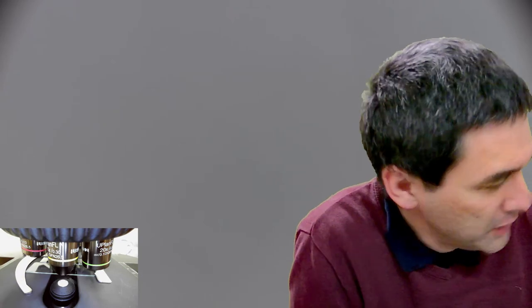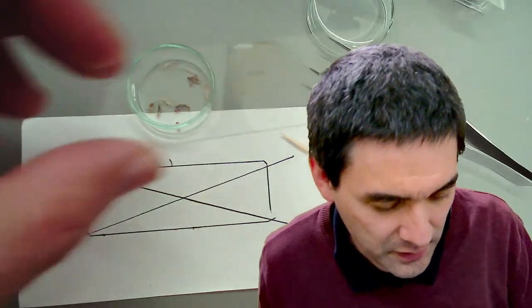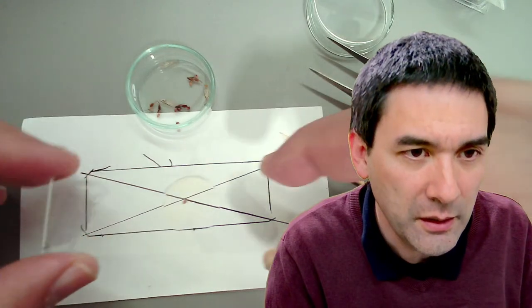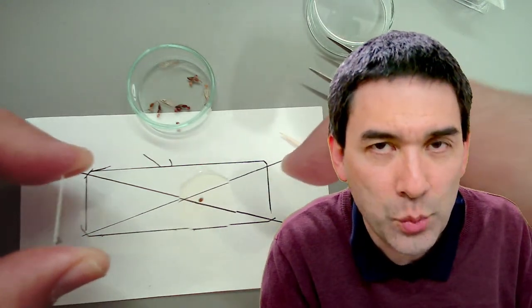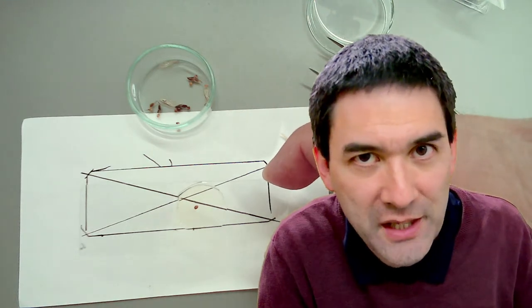And I'm going to keep on making a few of these permanent mounts, with the hope that some of them will turn out to be nice. Because the first try here was again a little bit off center. It's a little bit off center here, but it's fine. So I have to now store it horizontally for about 6 weeks. The slow drying process also has an advantage.